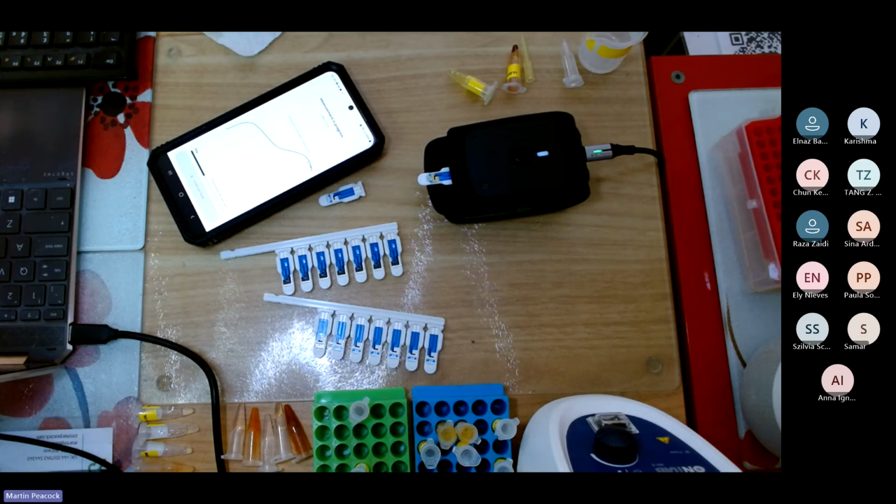So we're expecting the peak height to be proportional to the square root of scan rate in line with the Randles-Sevcik equation. So that is a bit bigger now. And then the third and the fourth one, I think, will just absolutely fly through. Again, I love that. Look, a 10-second sensor. People don't appreciate that. I understand that voltammetry gets distorted by scan rate, but it definitely improves the user experience to have faster scan rates. So this one is only about 7 seconds long, and then it's done.